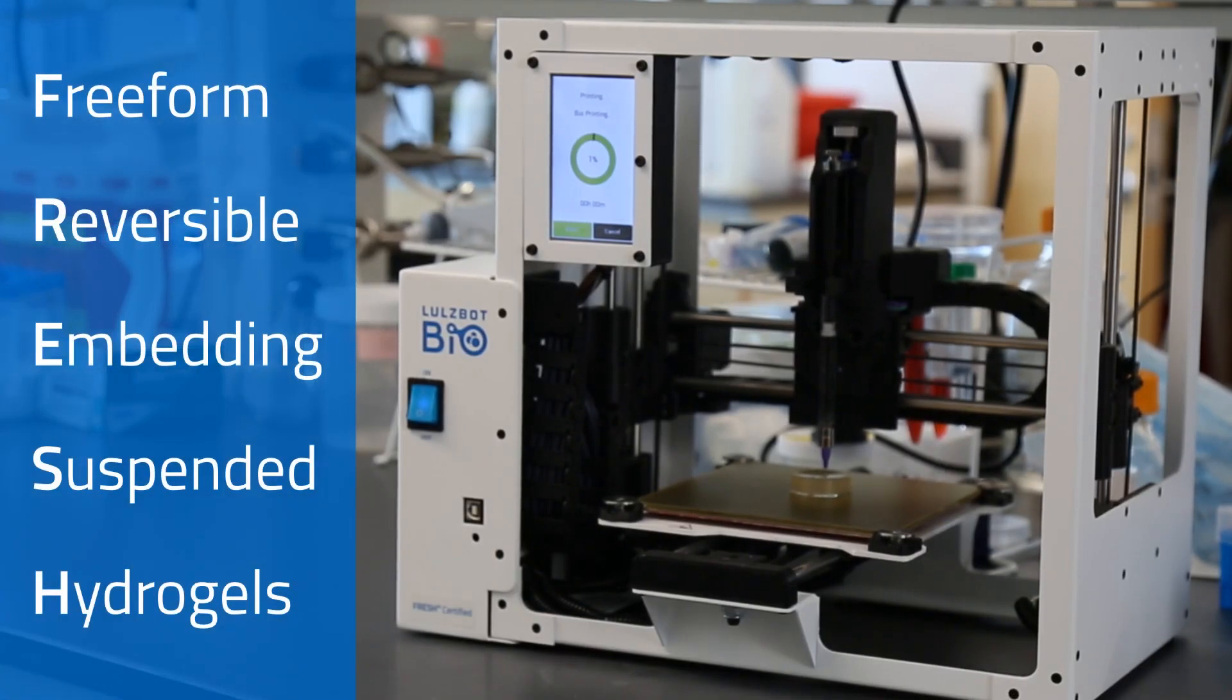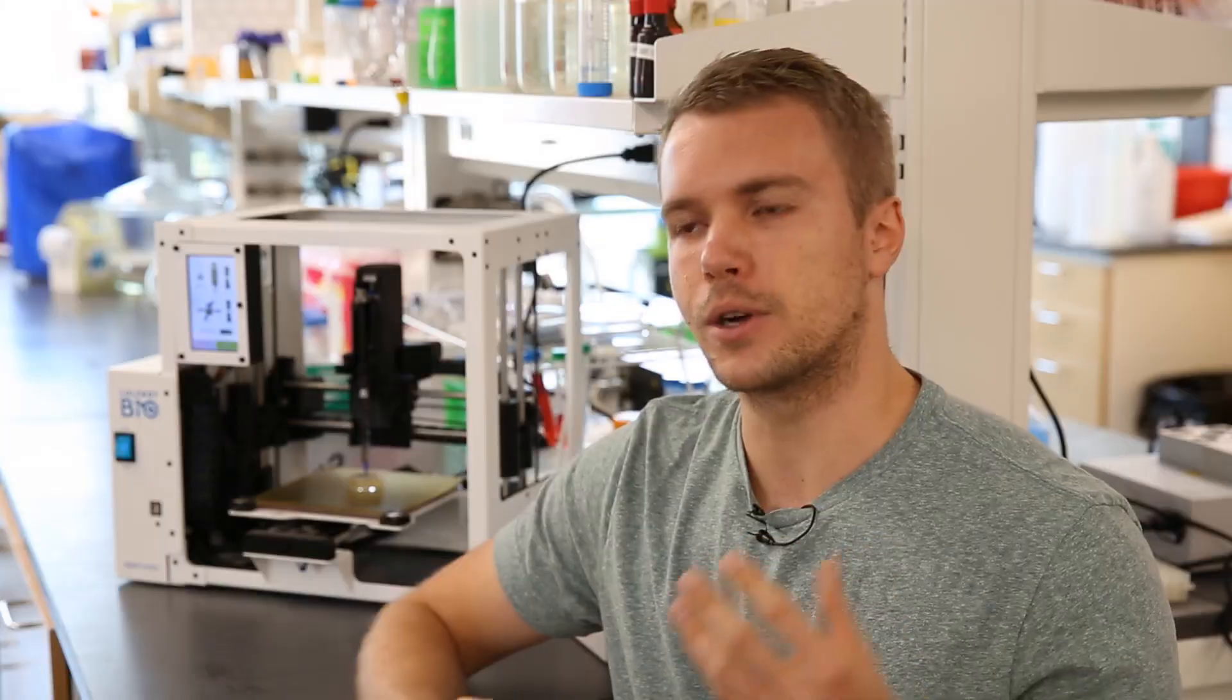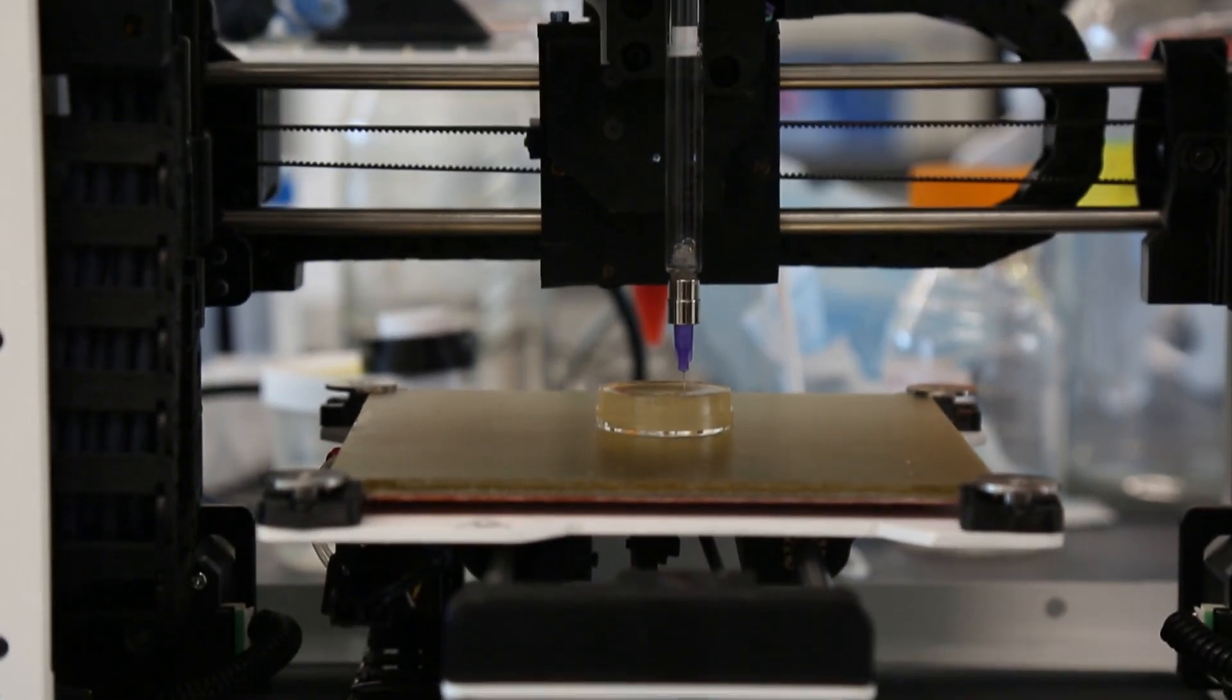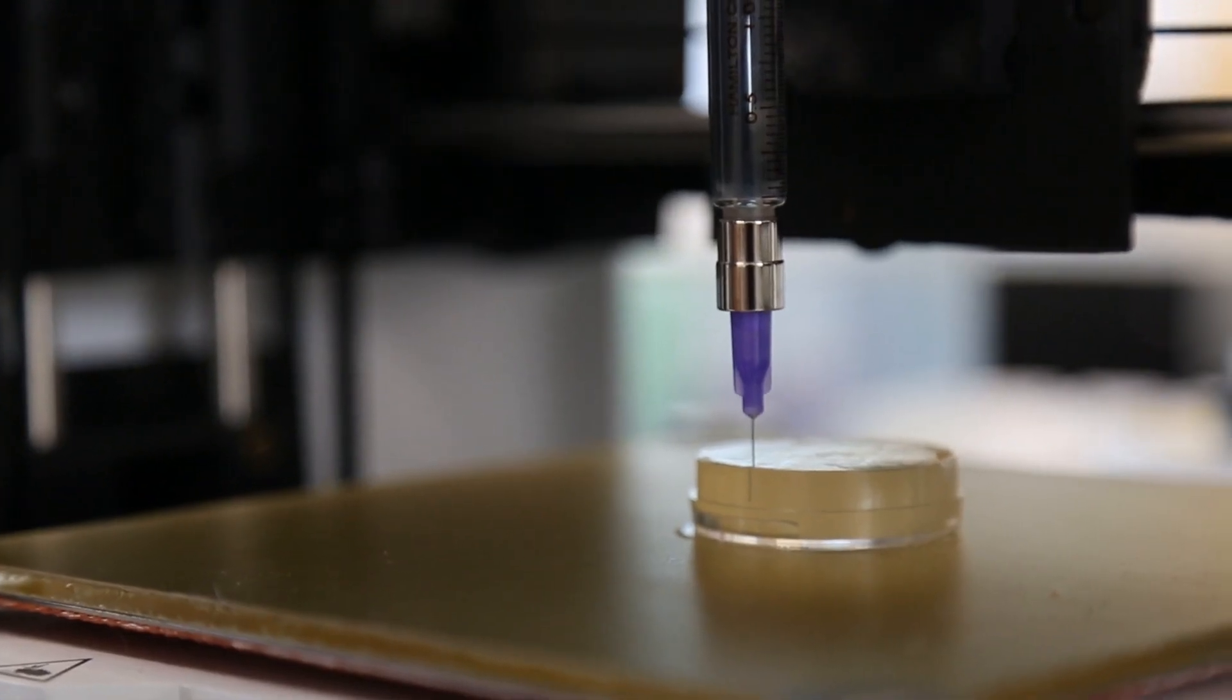FRESH is an acronym which stands for Freeform Reversible Embedding of Suspended Hydrogels. We actually drop a needle into a bath of support material. If you just printed it in air it would deform and you would never be able to create anything large.